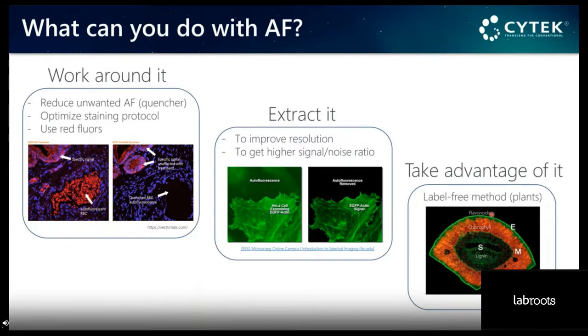So plants have pigments that are going to be fluorescent after excitation by multiple lasers, and that's what you could capture. So that's critical not only to take pretty pictures, but also to understand changes in that emission profile when you have photosynthesis, CO2 assimilation, changes in pH, or also treatment with different chemicals, and measure those differences without using any label or staining.